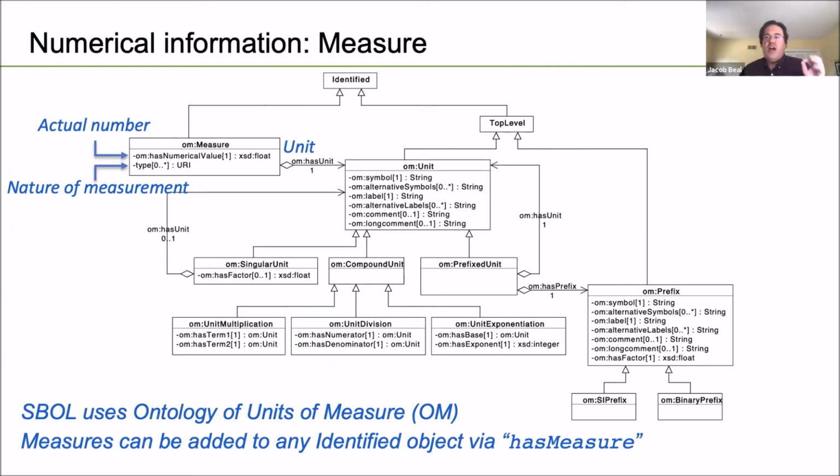If you want to talk about something more qualitative, like the example of a protein knockout: if you know the gene knockout, like you did an edit and you removed that gene, you can express that by saying a deletion. If you just know somebody gave you a knockout mouse and that knockout mouse doesn't make some random protein anymore, that's where I would suggest doing it with a measure, where you say that the measure of protein in this mouse is 0, because you don't have enough information to express that at the genetic level.